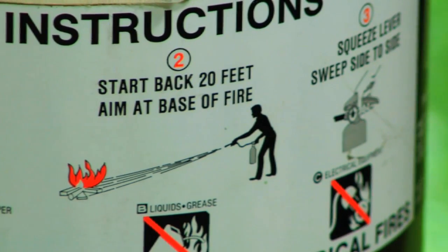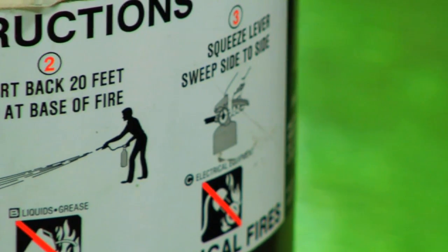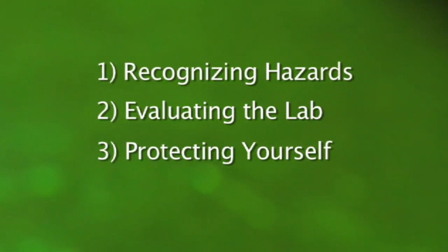This video will identify three critical components to fire and life safety readiness for the laboratory: recognizing hazards, evaluating the laboratory, and protecting yourself.